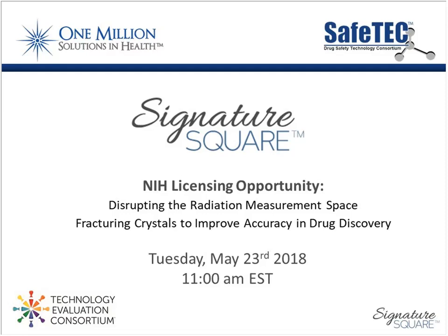So fundamentally, we're going to be looking at a new dose calibrator for radioactive tracers in biodistribution studies that can vastly increase the accuracy, perhaps even tenfold. So this webinar will introduce a groundbreaking new dose calibrator for radioactive tracers in biodistribution studies that has the potential to advance the technology to a new level of sensitivity, accuracy, and range for small radiation doses.